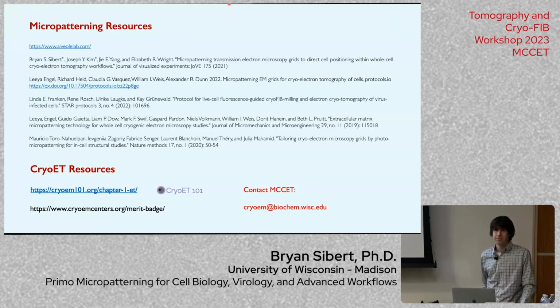I had a question about the PRIMO. Do you contract use of the PRIMO for BSL-2 samples? Yes. Our PRIMO is in our BSL-2 lab, so we can do BSL-2 samples. And you can contract that out, so if I wanted to send some samples over, that would be possible? Yes. Oh, nice.